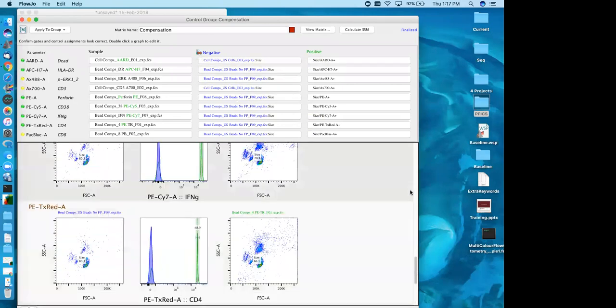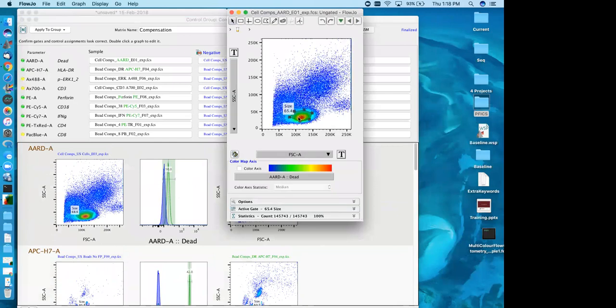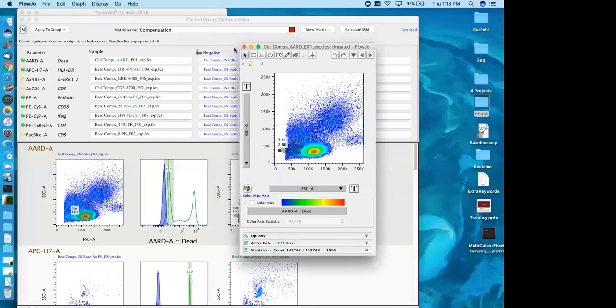All right, so let's go back to live data, which actually did need a correction, just to demo actually correcting something that needs it. So in this case, our algorithm is looking for a nice, bright, big, dense population, and it finds some really nice live lymphocytes. But this is the live dead marker. And so perhaps what we'd like to do is find some dead cells to include. And so maybe we'll move that down a little bit. Okay, we'll get a nice bright peak pop up there.